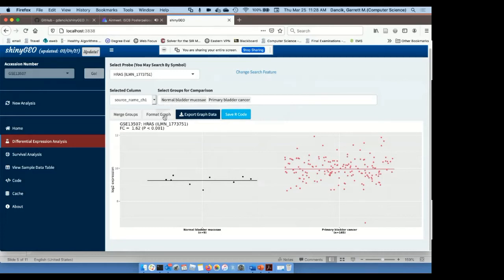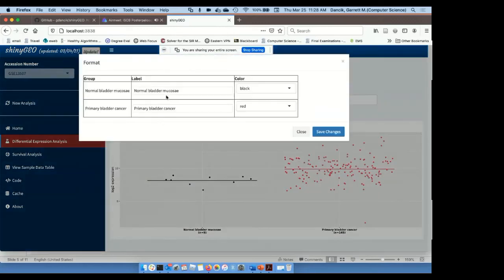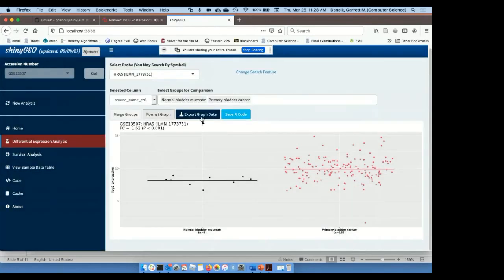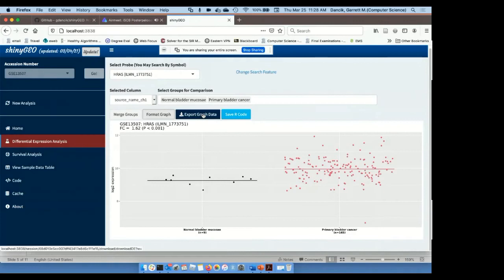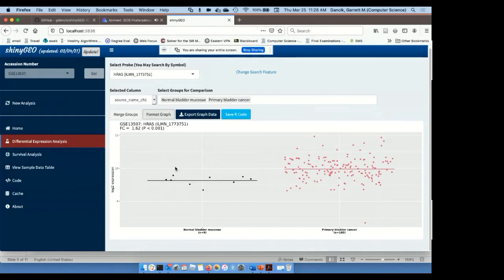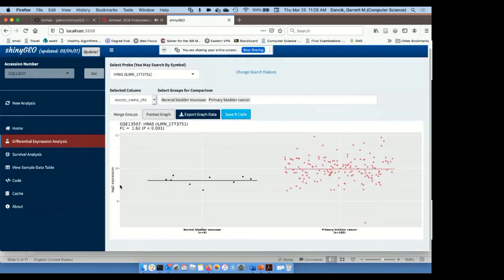For both the differential expression and survival analyses, we have options to format the graph. In this case, I can change the labels as well as the colors. We can also export the graph data. In this case, that's going to give us the expression values as well as the group labels, which would allow someone to generate their own graphs or do additional analyses on that data. And I can also click save R code to generate the R code that was used to produce this graph.